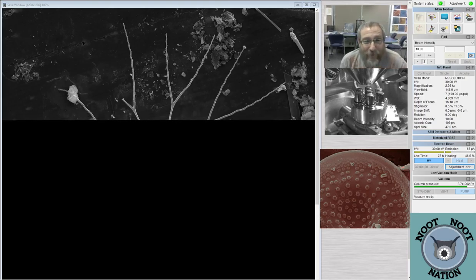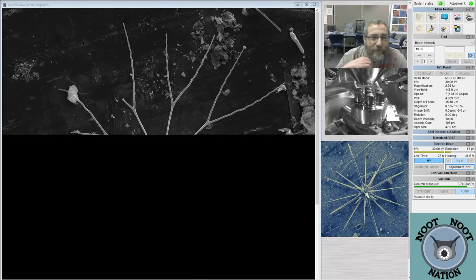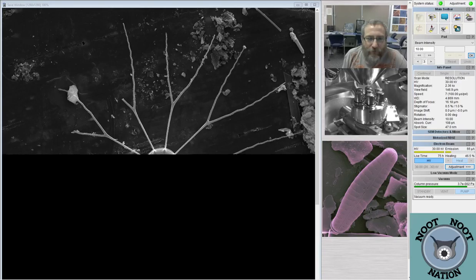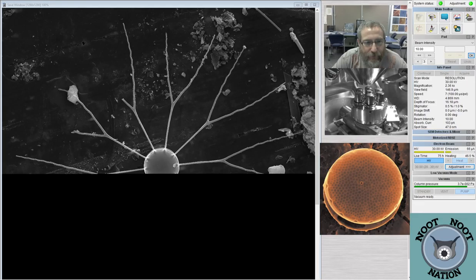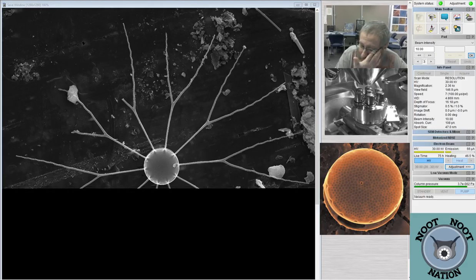So here's the thing. For me, because I'm looking at stuff in an estuary, it's really interesting because it's a mix of freshwater and marine stuff that ends up in the sample, so there are these places where there's this mixing. And I think it's really neat to have an idea. If you were looking at a lake that would sometimes get salt water flushed into it, right? Yes. And sometimes I do look at lakes that get salt water flushed into them. So there is a value to knowing this stuff.